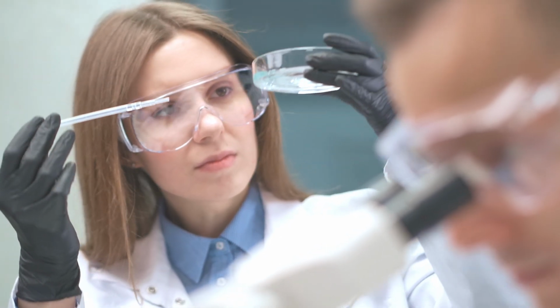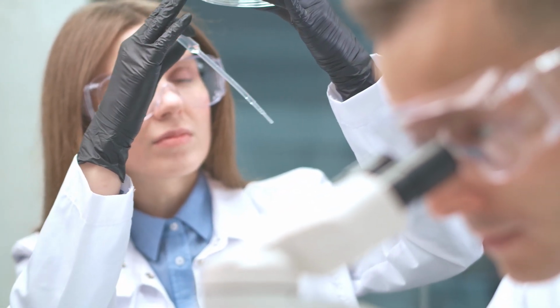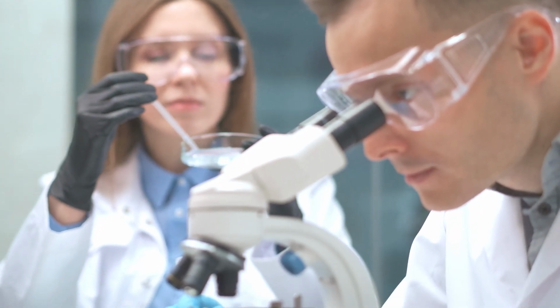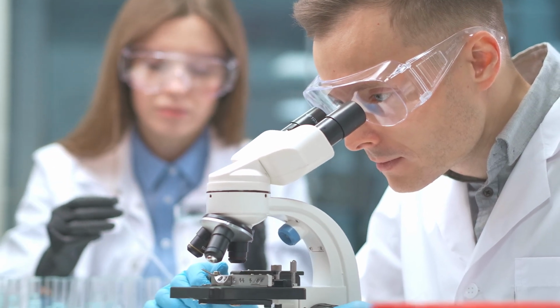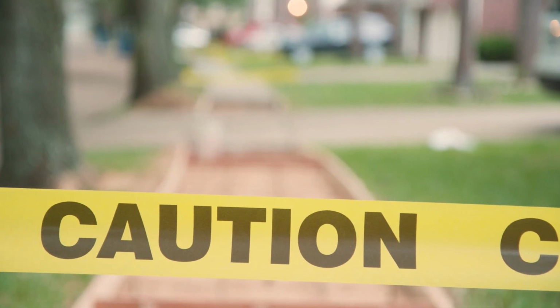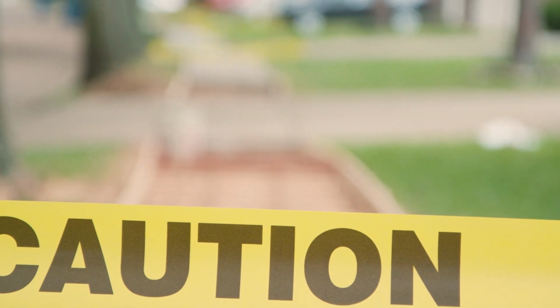While glove rating charts serve as general guidelines for the effective use of gloves as PPE, it should be noted that manufacturers perform permeation and degradation tests under lab test conditions, which can vary from actual conditions in your work environment. Often, for chemicals that have not been well characterized or are new, the line between safety and risk is blurry.